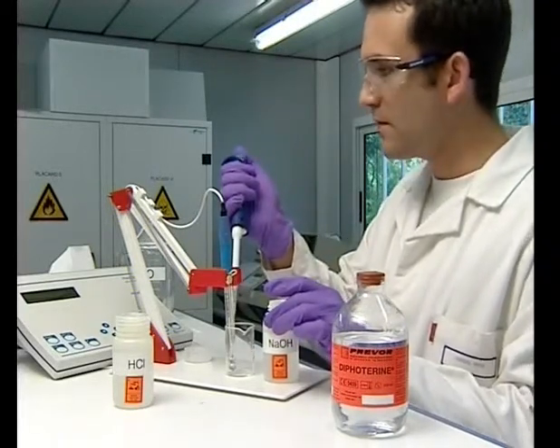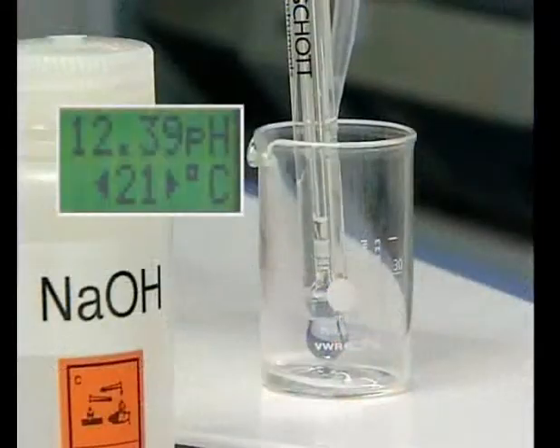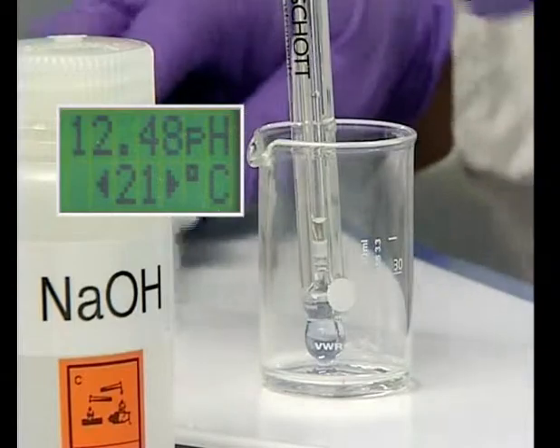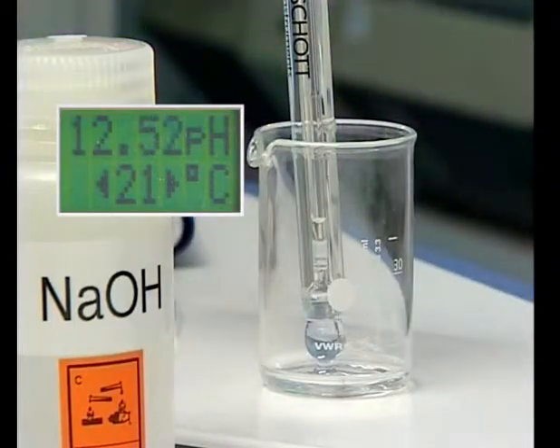First of all, we will take one milliliter of 1N caustic soda. The pH value is around 14, which means that it is strongly basic.